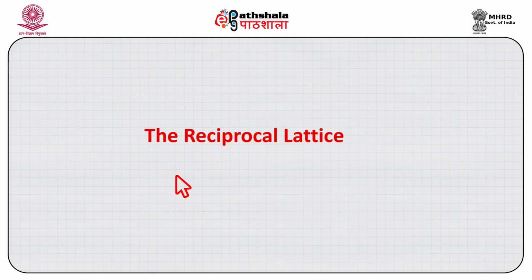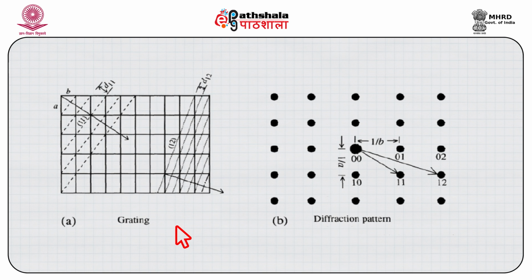For generation of constructive diffraction in 1 or 2 dimensions, the diffracted beams are produced simultaneously without any specific orientation of the incident beam in relation to the object grating. But in 3 dimensions specific geometrical conditions are required to produce diffraction, as it requires simultaneous solution of the 3 diffraction equations. Now, in this diagram, we will have a look at 2 dimensional diffraction patterns relating the object and the diffraction pattern, following the Abbe theory which we learnt earlier.